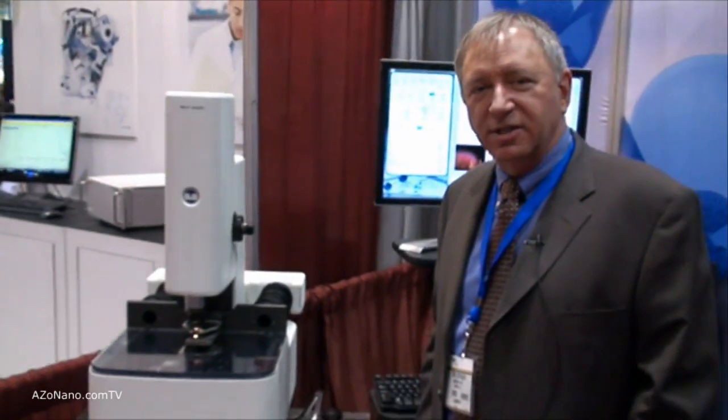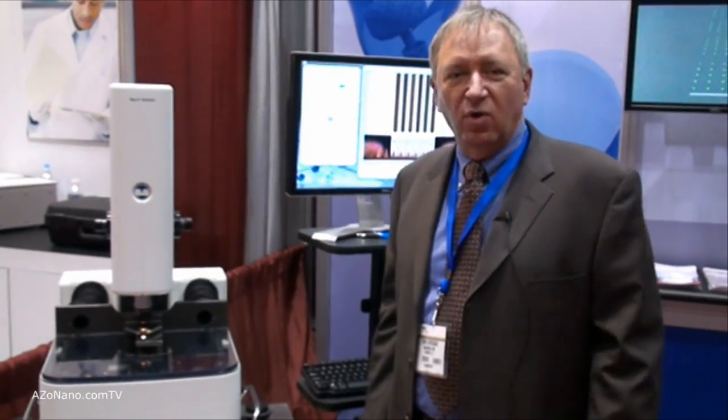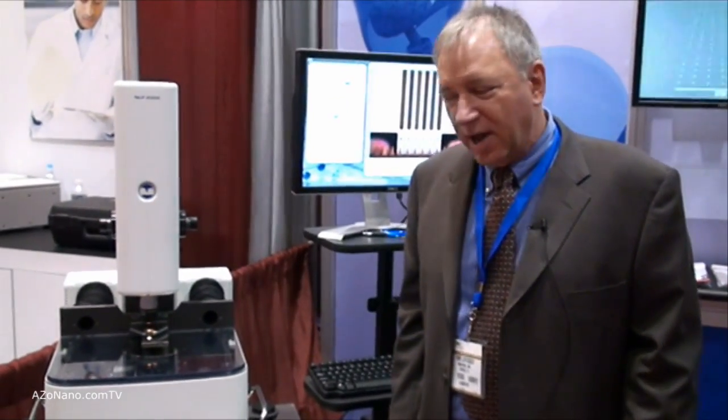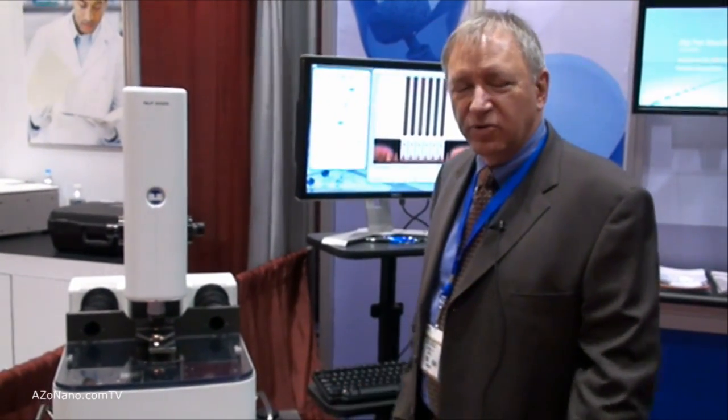NLP2000 is a micro-patterning tool. It's a tool that uses our technique of dip pen nanolithography that we've pioneered and have in over 60 laboratories with our inscriptor products, but it's a tool that allows a different audience of people to operate it.